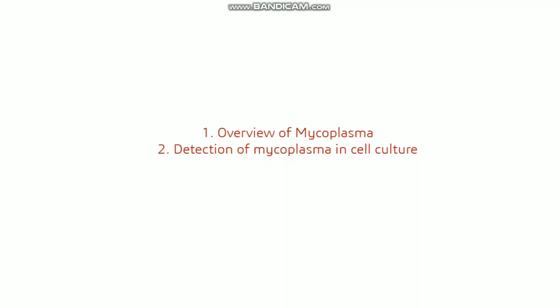In this tutorial video, I'm going to talk about an overview of mycoplasma and detection of mycoplasma in cell culture. As we know, most cells are contaminated by mycoplasma, so we need to know about mycoplasma in detail. Here I will discuss mycoplasma in detail, so watch this video till the end.